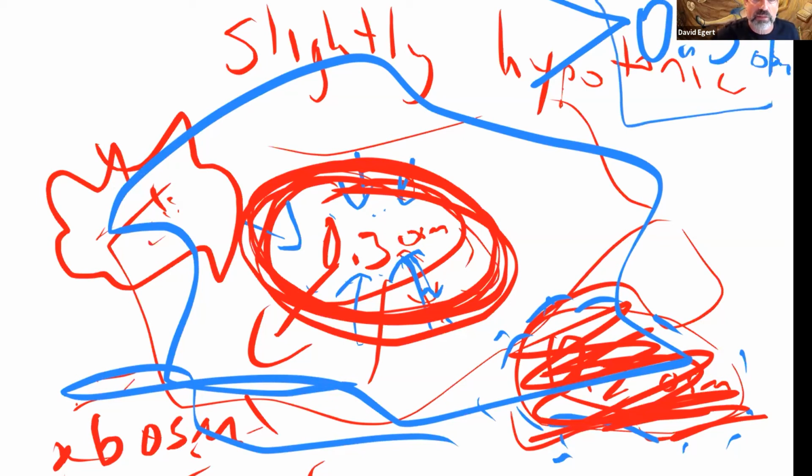If you're at 0.3, we're in equilibrium and the cell stays happy. If we're above 0.3 in the solution, we start crenating. If we're below 0.3, it will start inflating a bit. Slightly hypotonic isn't necessarily a disaster. It just means things take on a little more water. But very hypotonic is a disaster.